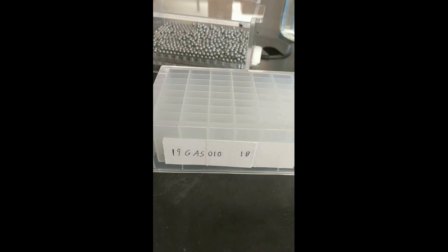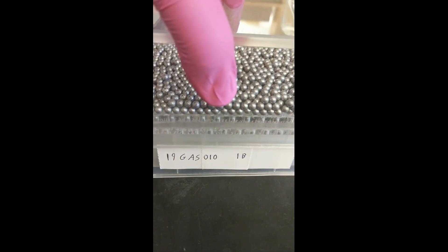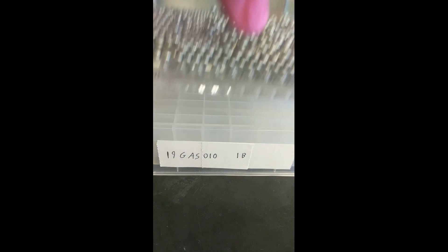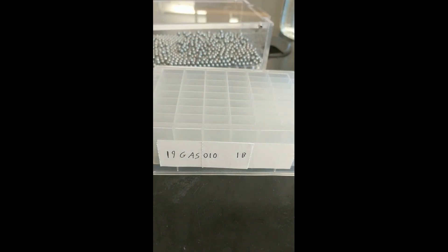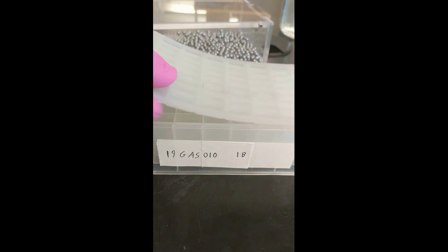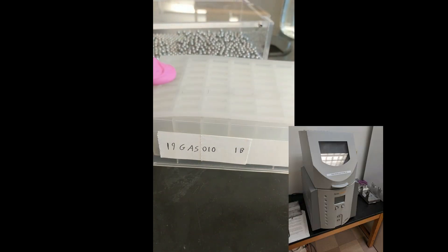We will then place two BBs into each cell using apparatus such as this or placing the BBs in by hand. We will then seal up the plate and take it to the genome grinder.